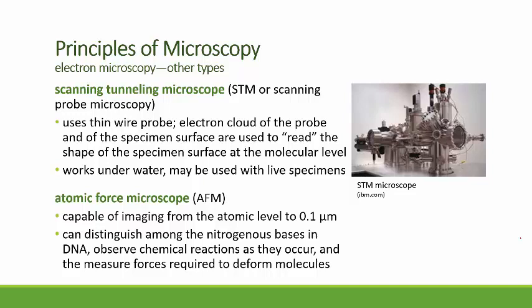And then atomic force microscopy can get all the way down to images at the atomic level, so we can see images of atoms all the way up to 0.1 micron. So it can take super small to very large images, or produce them to almost the same kind of resolution as light microscopy. You can get a real range from the angstrom level up to 0.1 microns.